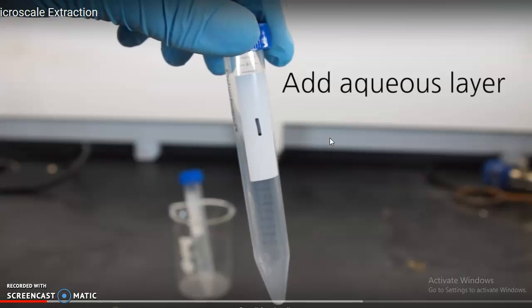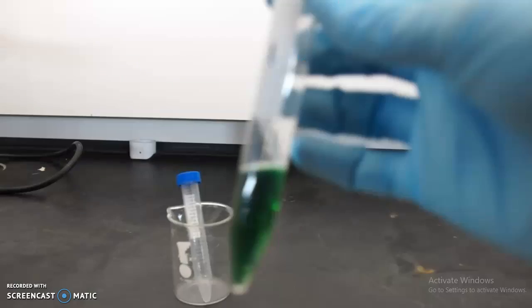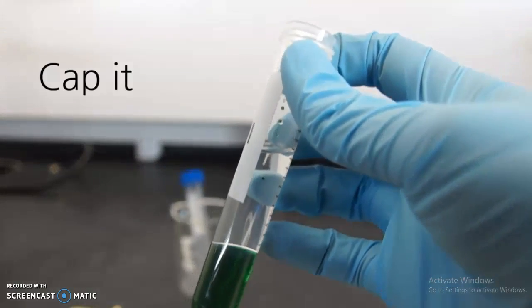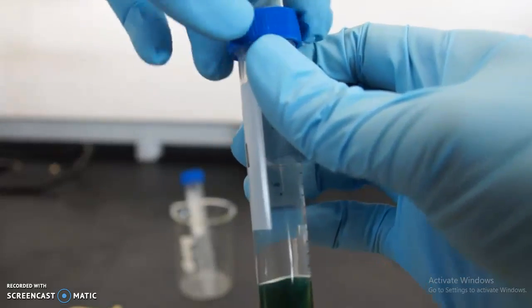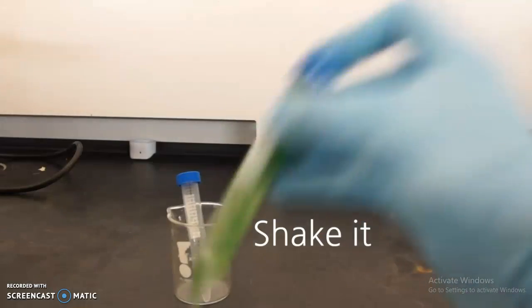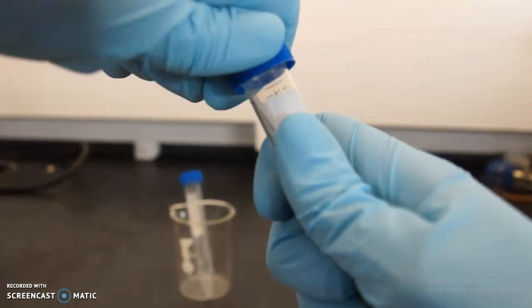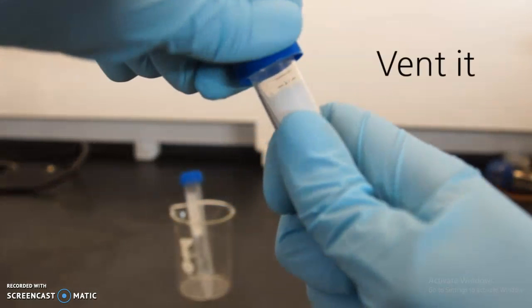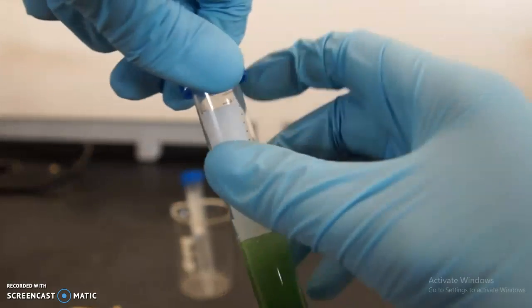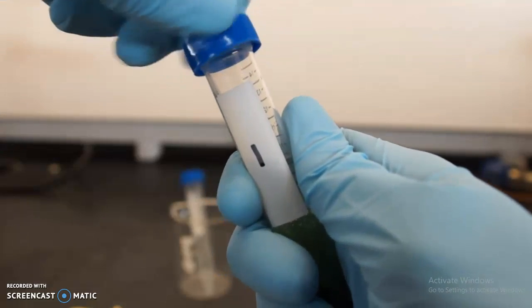First, add the aqueous layer. Now add the organic layer. When you have your two layers, cap the tube. Now give the tube a good shake. After shaking, it's important to loosen the cap a little bit and vent the tube. Repeat the process of venting and shaking the tube about 4 to 6 times.